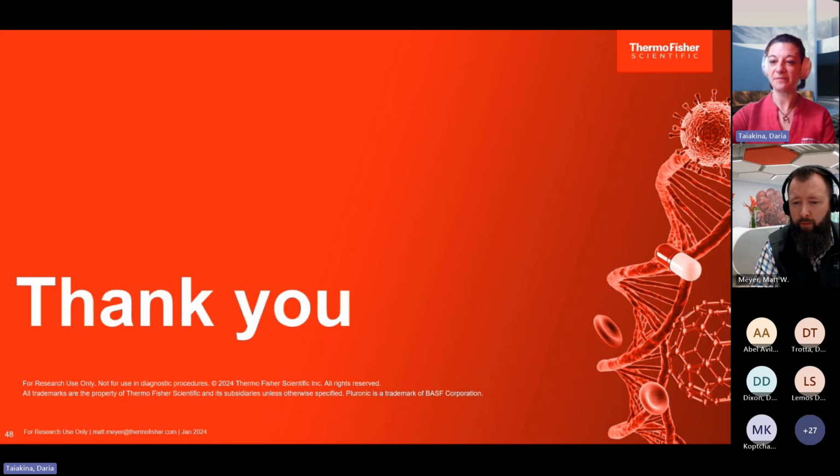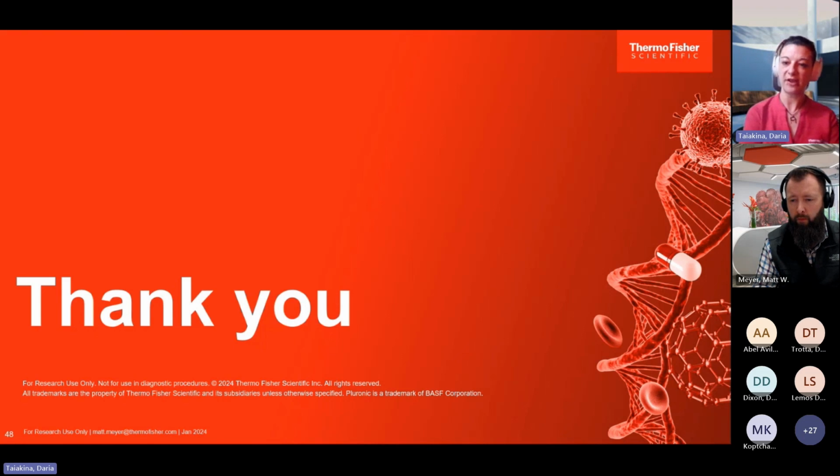We had a few questions submitted, so I'll start with those. First question: while calculating the percent recovery, the number of cells sorted would mean the total number of cells before sorting began, or is it the sum of total cells collected in the 2 channels post-sorting?